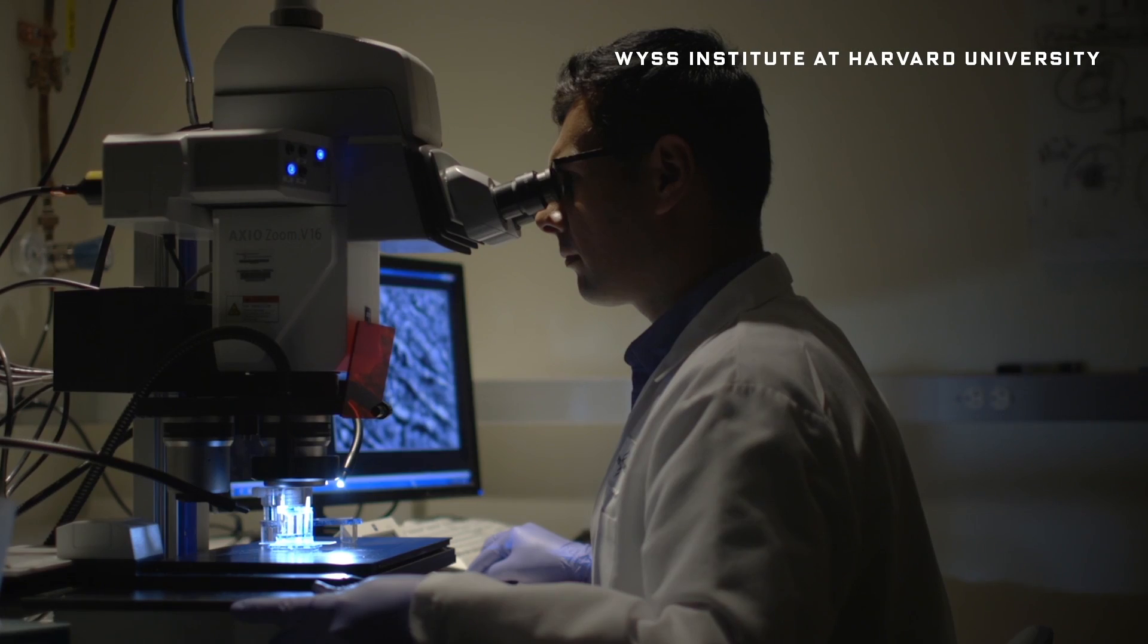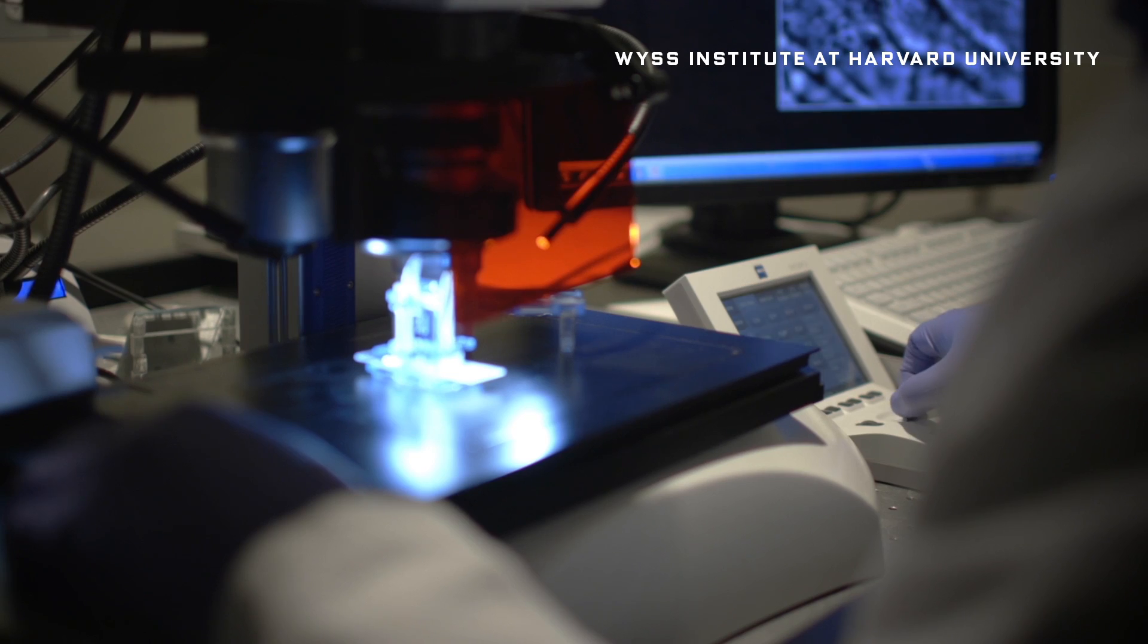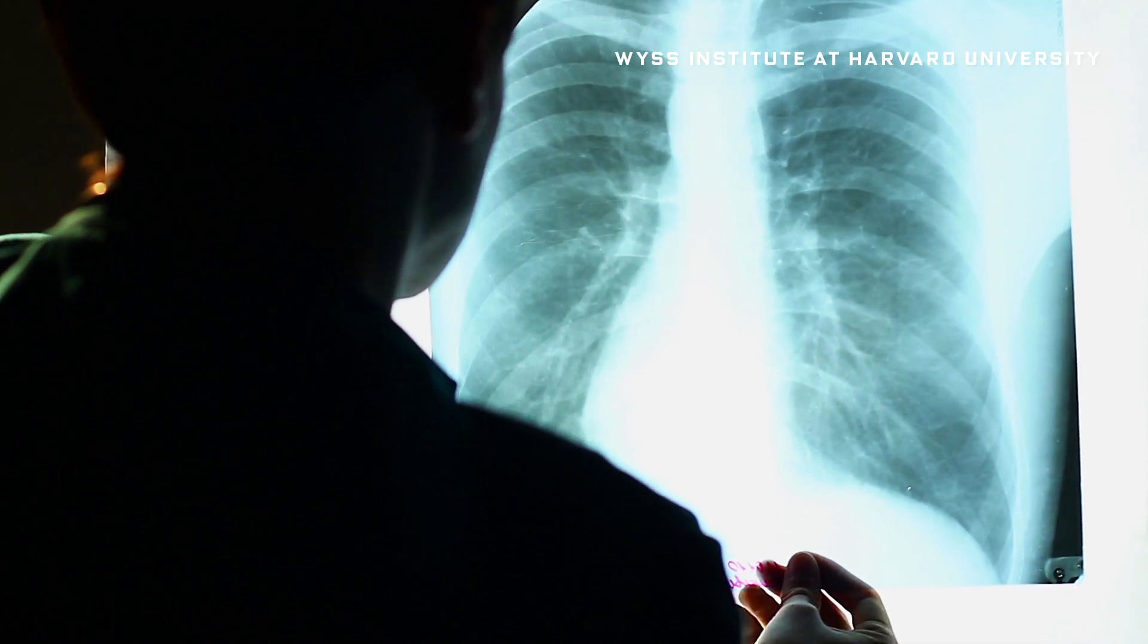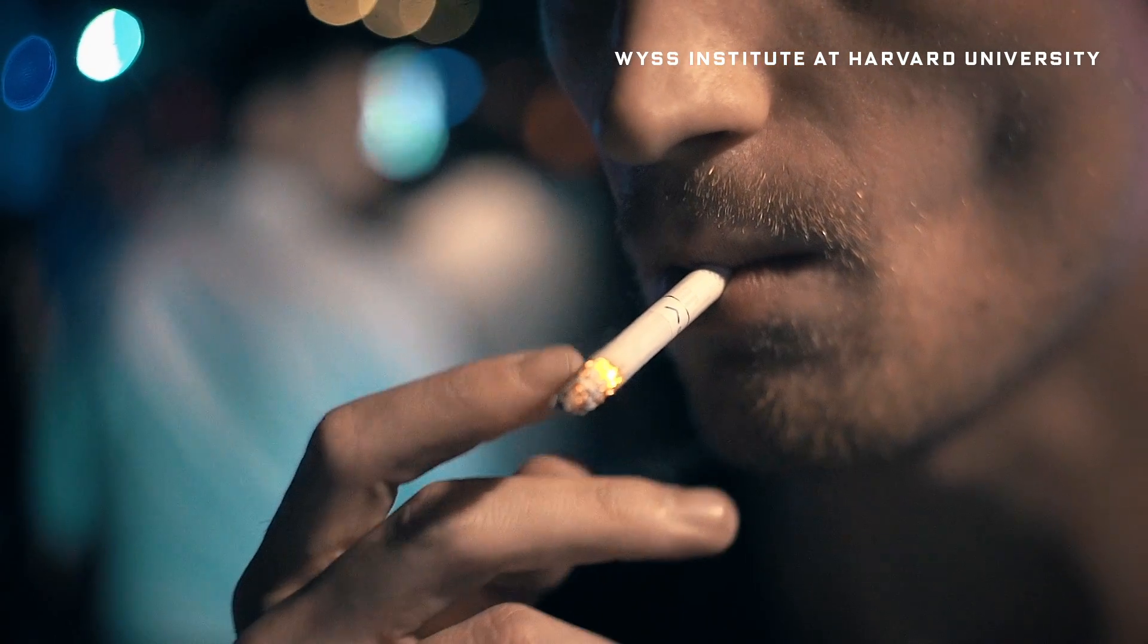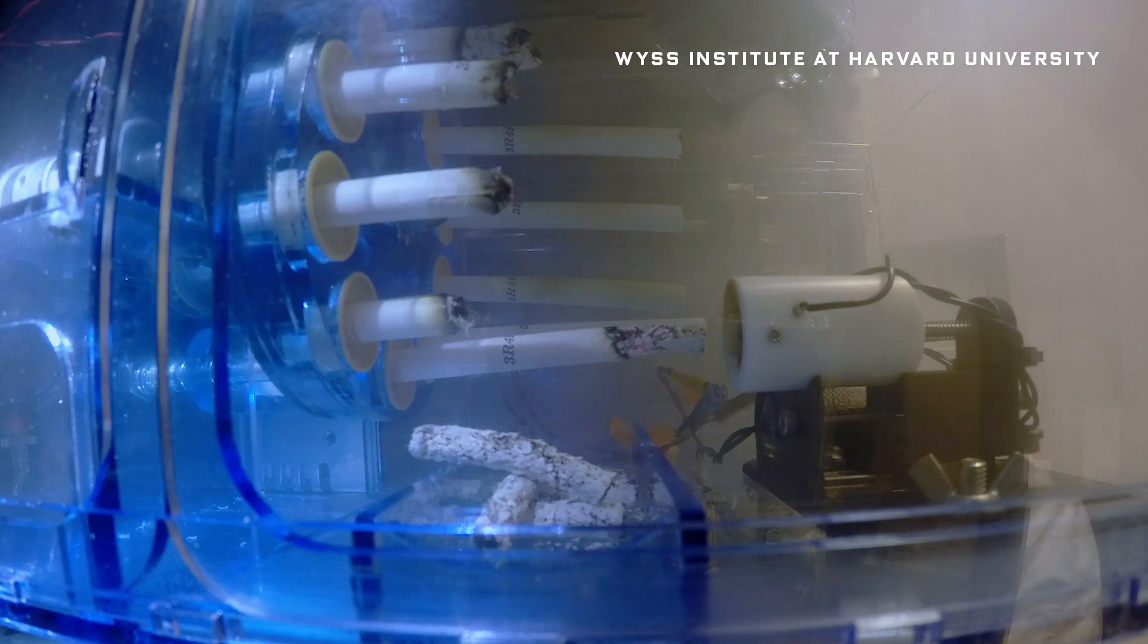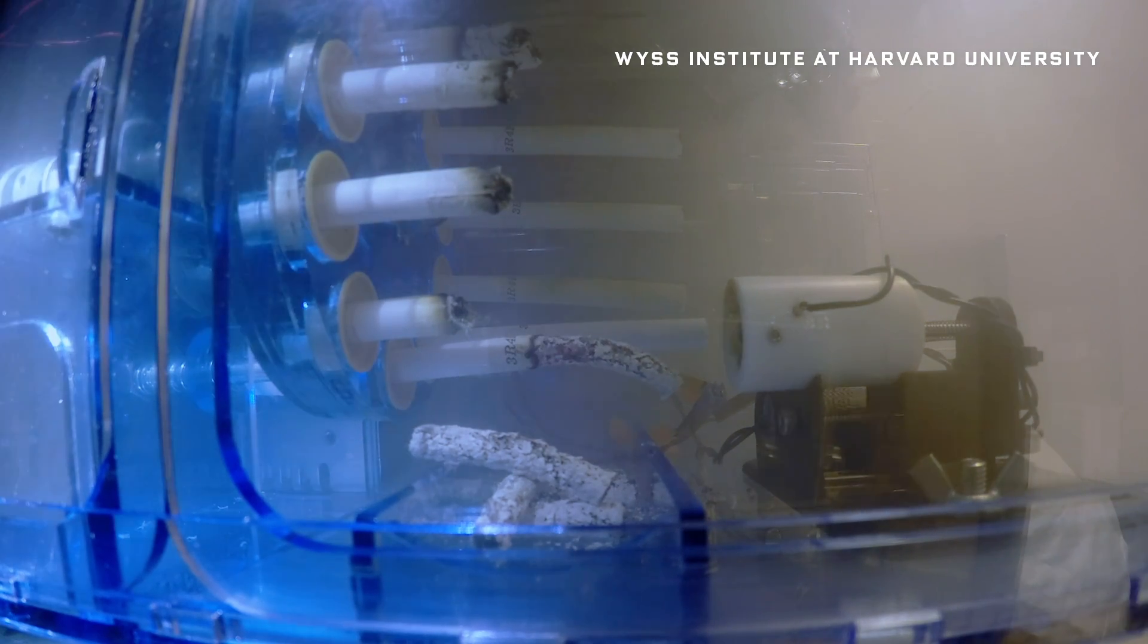Because it's helping scientists at the Wyss Institute at Harvard better understand COPD, or chronic obstructive pulmonary disease—that'd be the intense coughing, shortness of breath, and infections common among smokers. This thing is pretty darn brilliant.